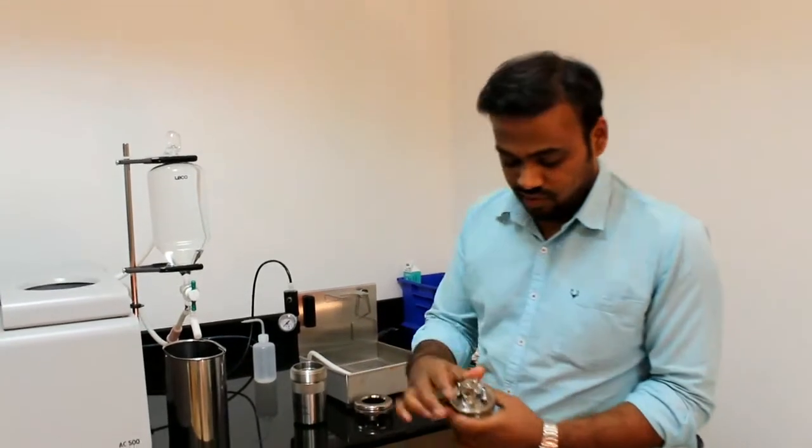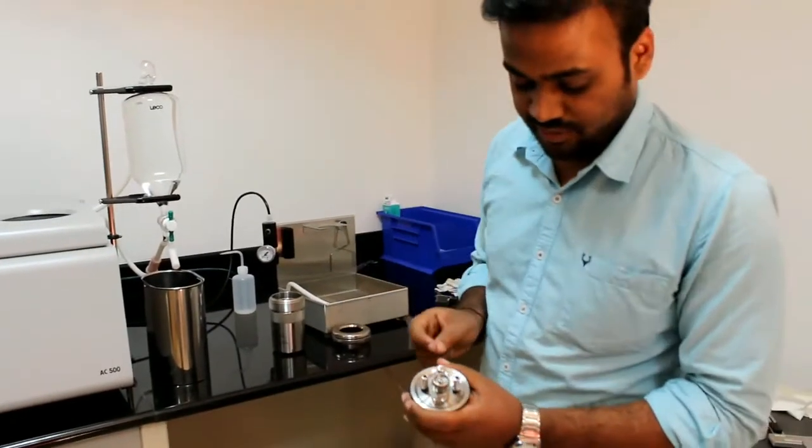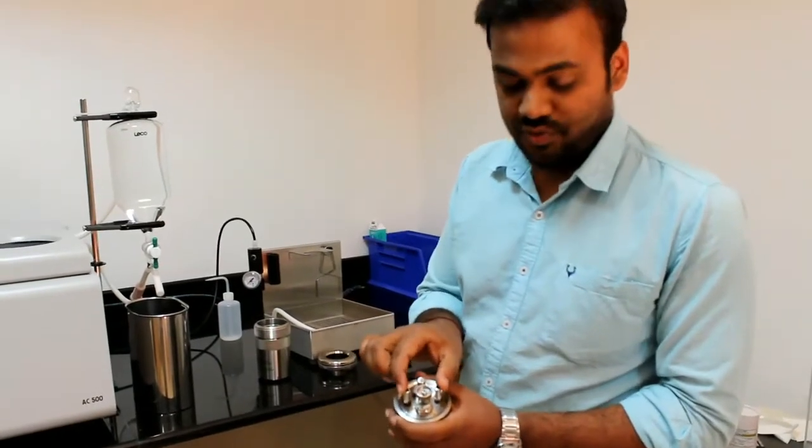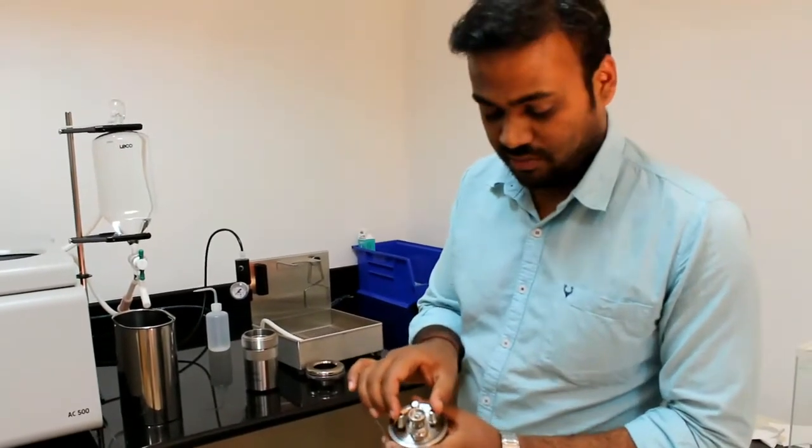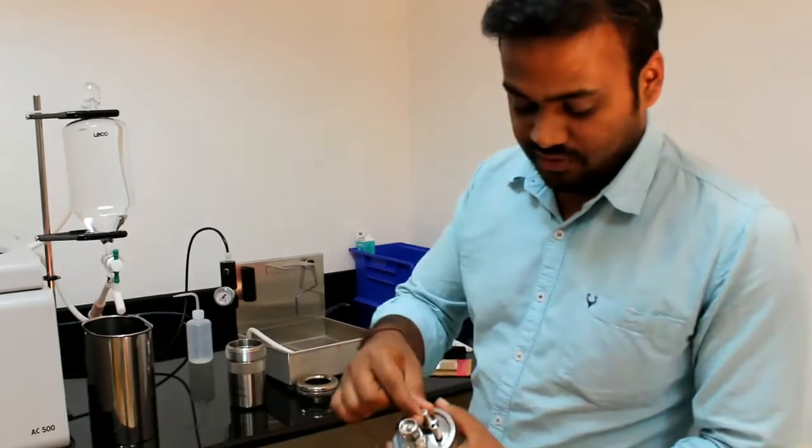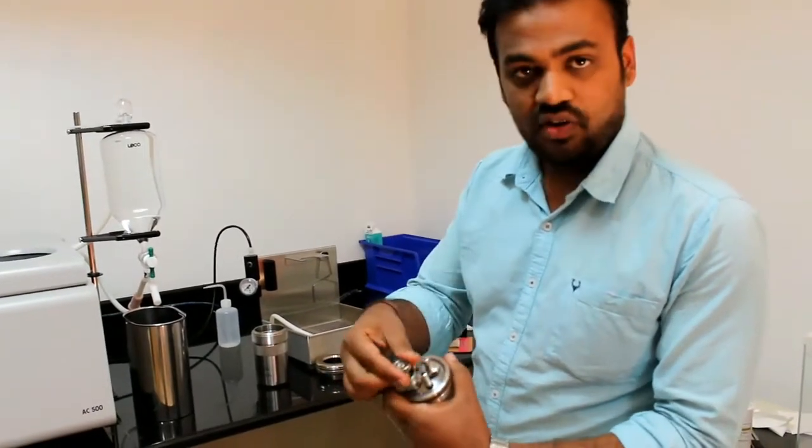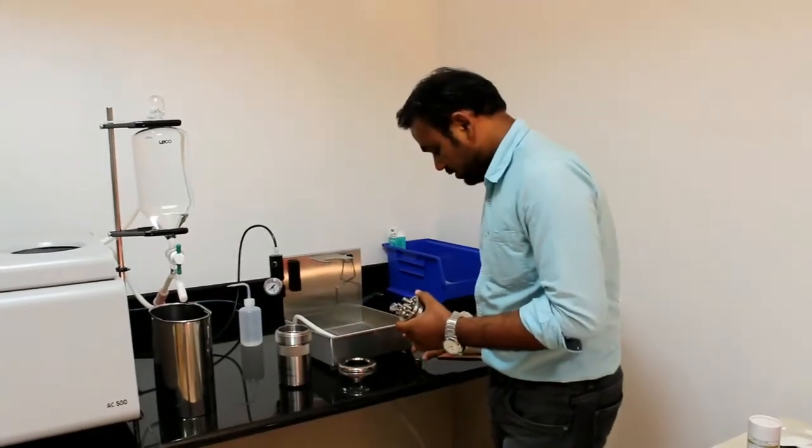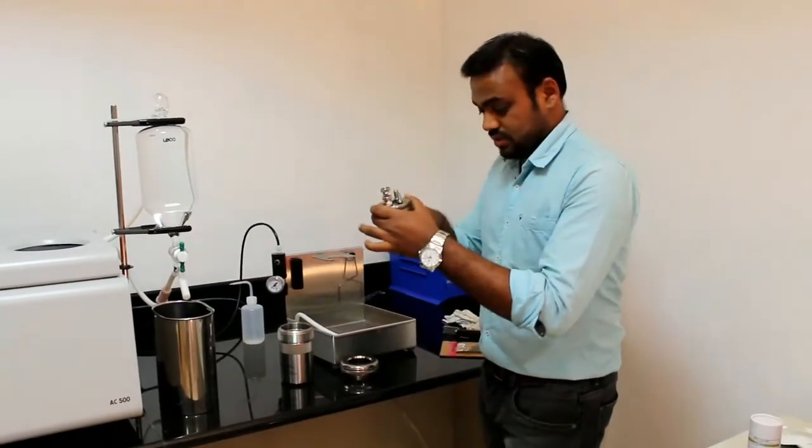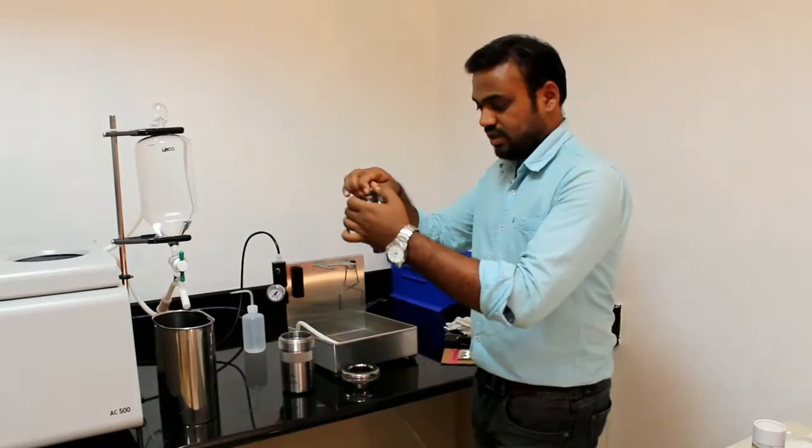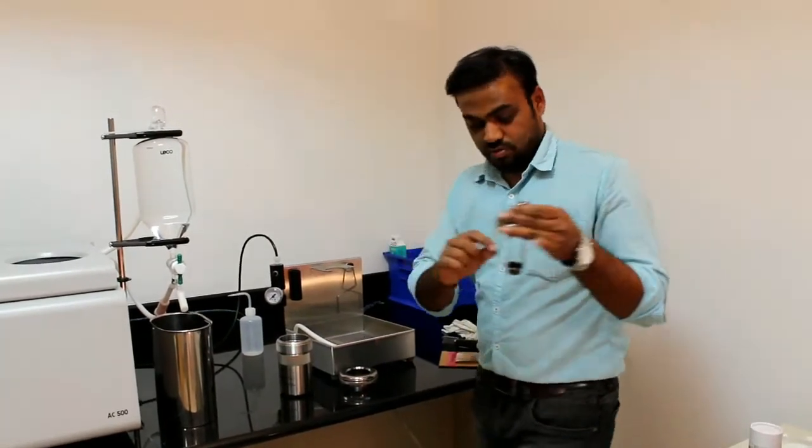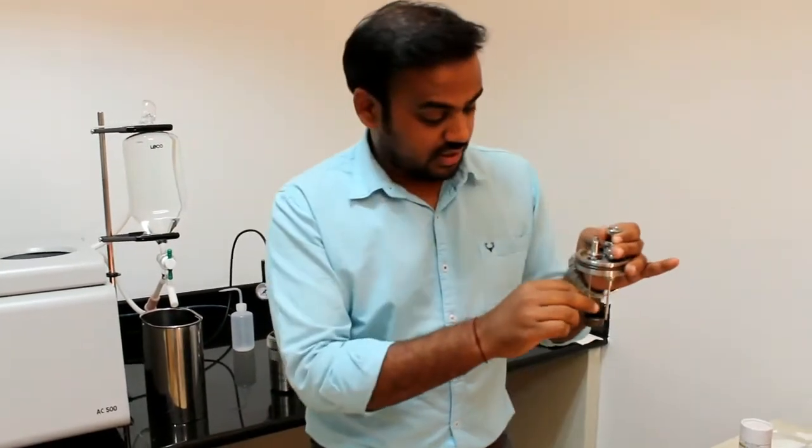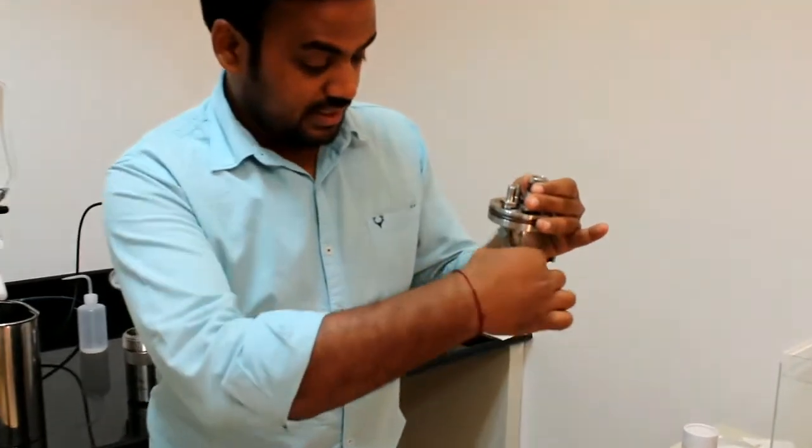In this wire, we have actually four sections in this combustion vessel. These two are for electrodes, which will supply the 29 volts DC voltage. And this is for oxygen filling and this is for oxygen releasing. Now we will place our crucible into the crucible holder. So make sure this wire will touch the sample.